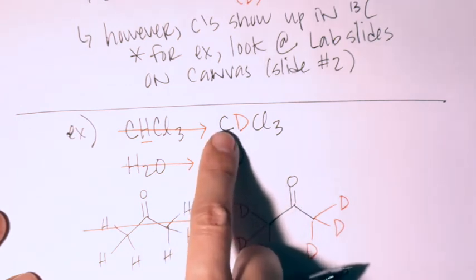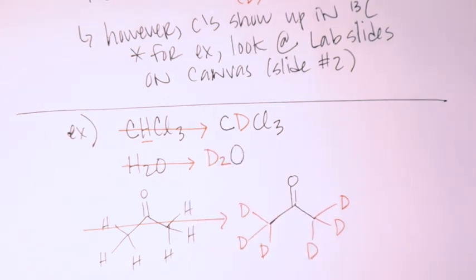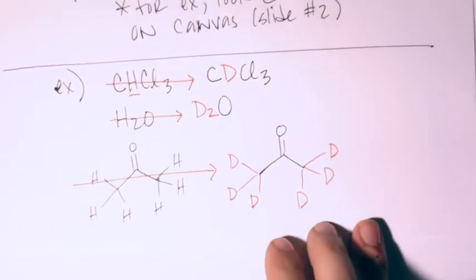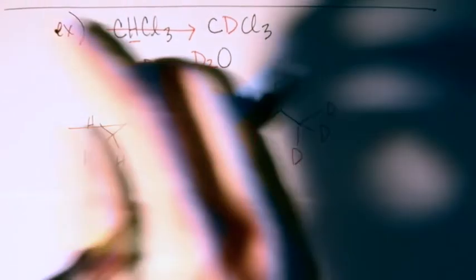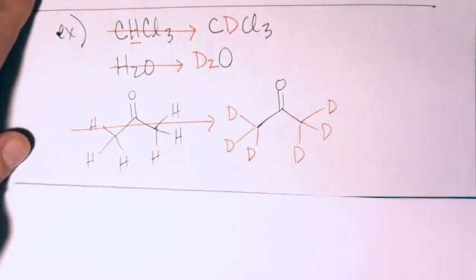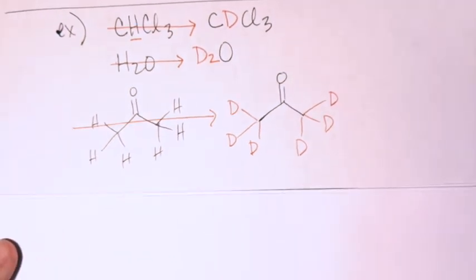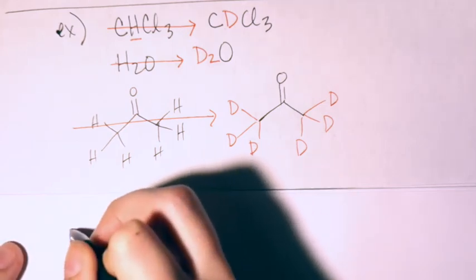But this one gives you some weird peaks around 70, and then this one, of course, would give you some peaks as well. So if those are in the spectrum, they'll be labeled, and I'll tell you that they're solvent, and you would just ignore those. You just would not pay attention to them. You just cross it out and say, oh, those are solvent. Ignore.